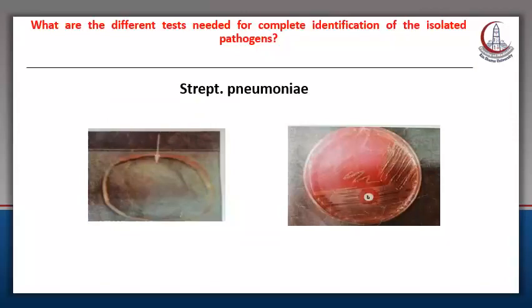Okay, as we proceed in the laboratory diagnosis, after we do the indirect film from the colony, if it was gram positive, the first test to do is the catalase test. To remember about the catalase test, its idea was as follows.